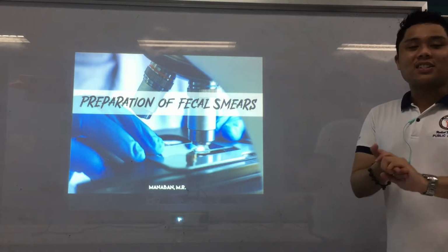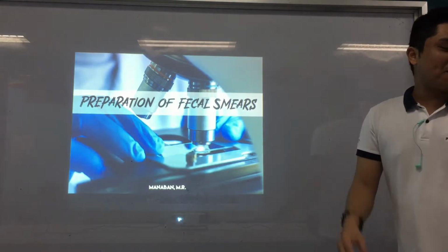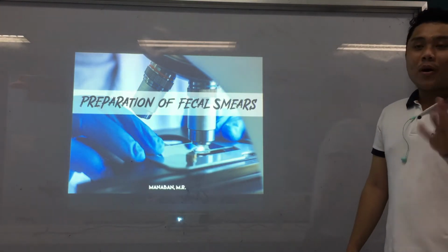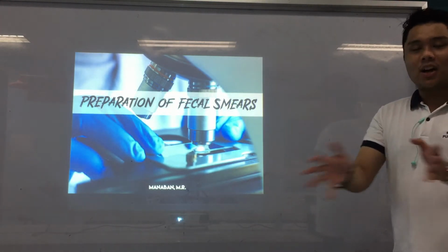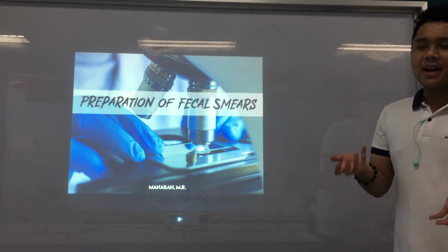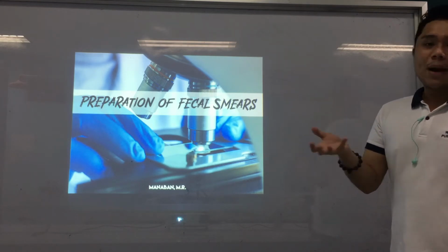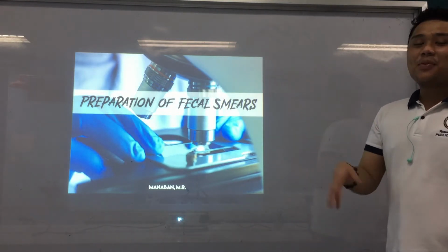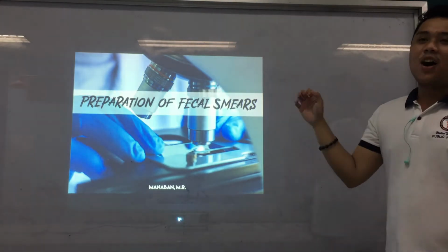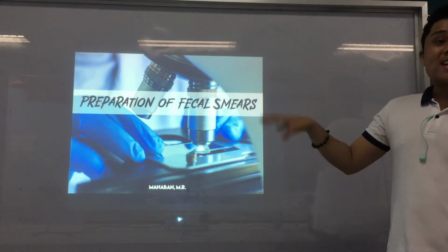But anyway, hello, dears. Again, good day to you there. Welcome to another pre-recorded lecture in our class in parasitology. For this lecture, what we're going to discuss now is the main bulk, if not the most common, method or laboratory activity that we need to perform in the parasitology laboratory. Again, this is the bulk of our work as medtechs in the parasitology lab, and that is the preparation of fecal smears, okay?